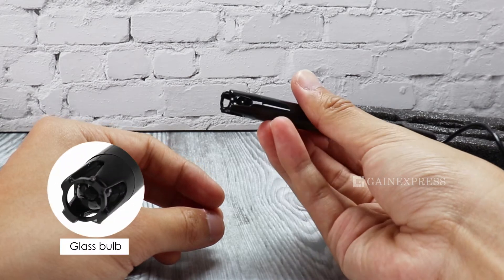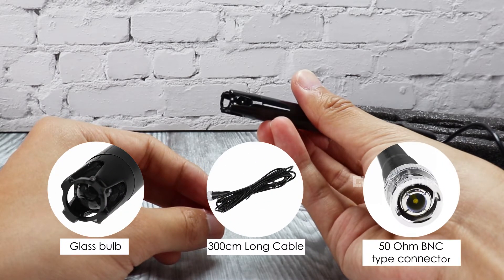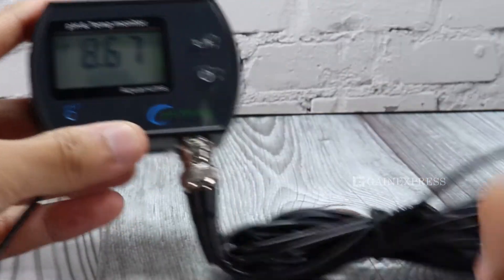This electrode is made of a glass bulb, has a 300 cm long cable, and a BNC type connector. Simply connect the replacement pH electrode directly to the input terminal of your pH device that has a BNC input terminal.